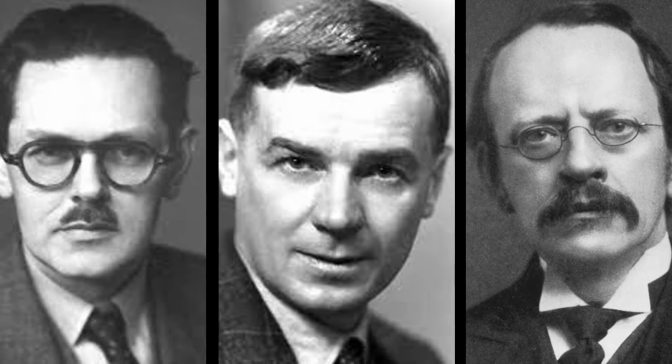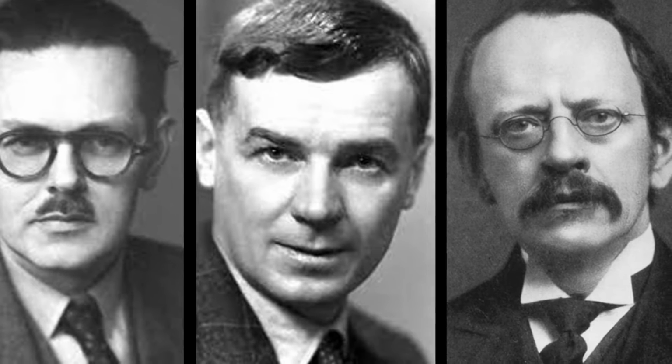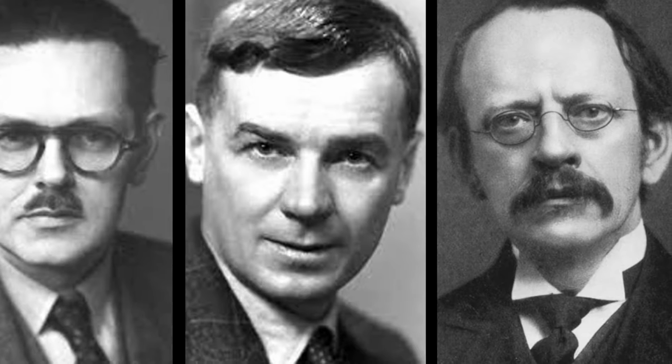The two men on the left are Anthony T. James and Archer J.P. Martin, the creators of gas chromatography, and the man on the right is J.J. Thomson, the creator of mass spectrometry.